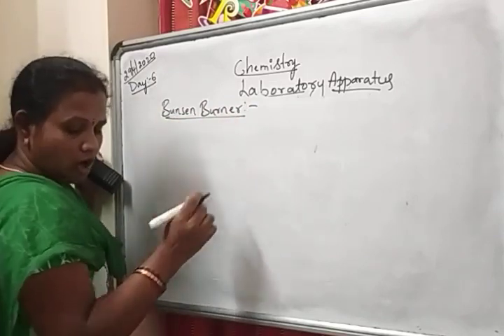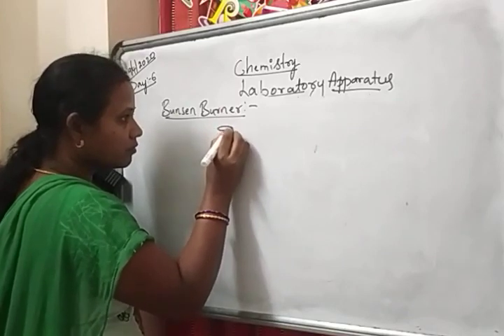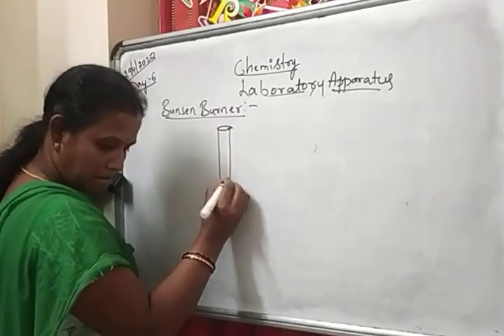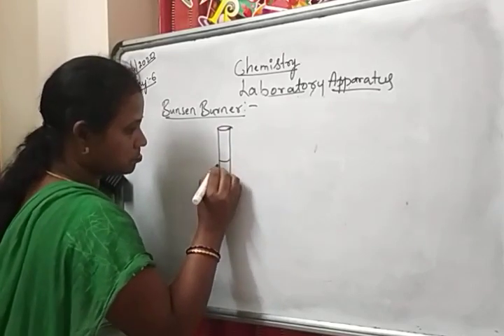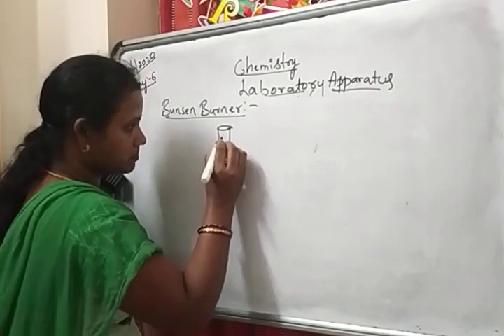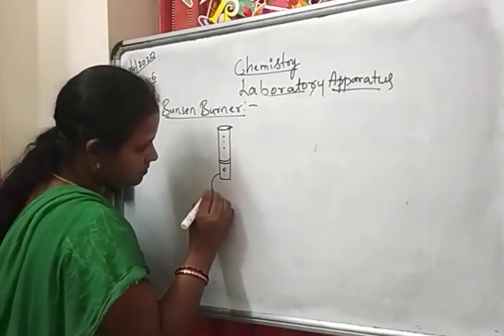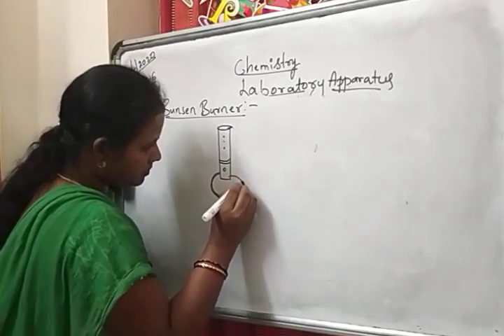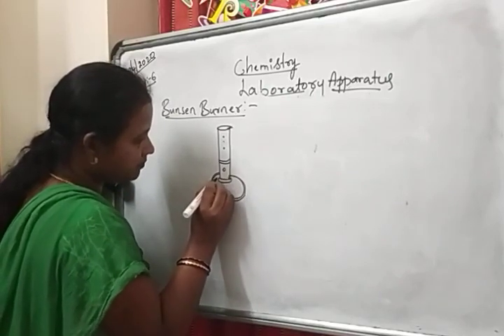How does this Bunsen burner look like? So this is the Bunsen burner here, children.